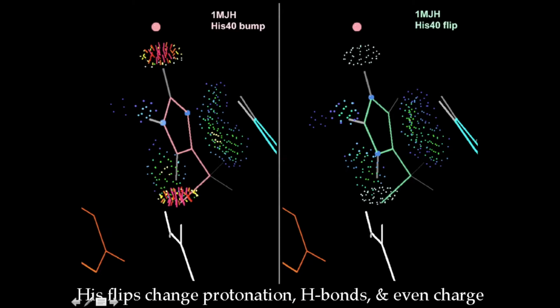And if you flip this histidine, which really looks about the same in even quite high resolution density, when you flip it, it exchanges carbons and nitrogens. And now you get 2 beautiful hydrogen bonds. And so this kind of change doesn't change the fit to the density, but it enormously improves the local chemistry and interactions. And so it's a pretty clear win.